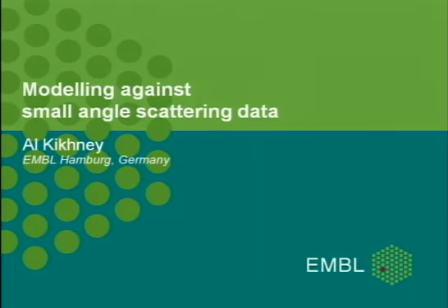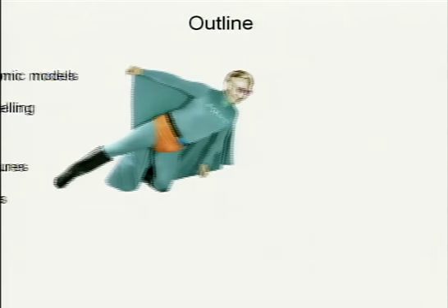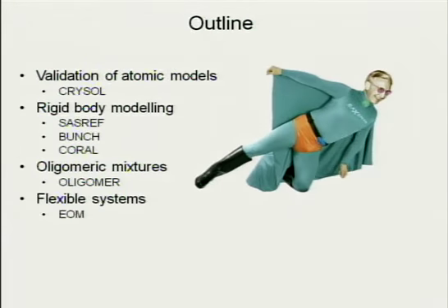So let's continue with advanced modeling. I will tell you in this talk how to validate high-resolution structures against solution scattering data. And we will have a good look at a process called rigid body modeling. And I will briefly tell you about how we can deal with oligomeric mixtures and with flexible proteins.